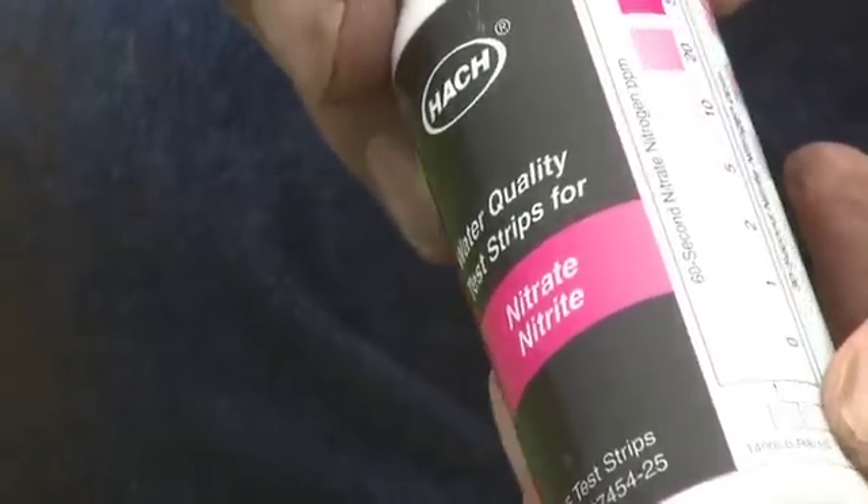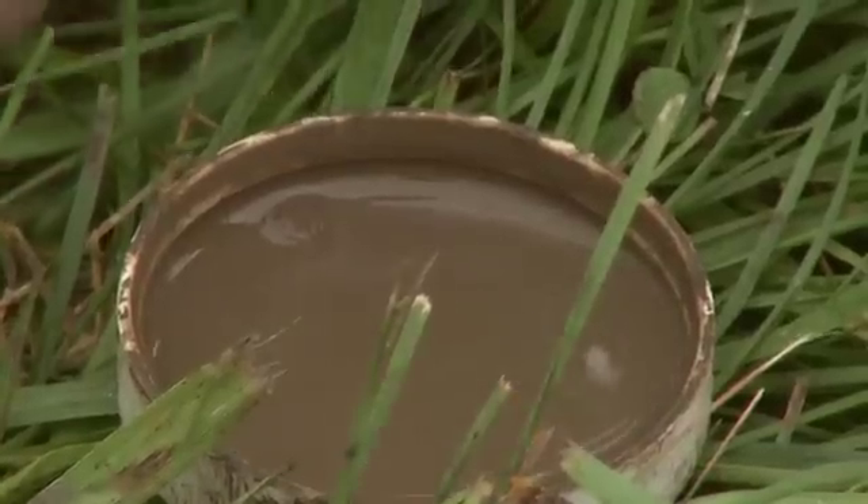We have the nitrate test strip bottle. It's got both nitrate and nitrite, and we're going to take a strip out. It's important that you keep this closed because it can get contaminated with moist air, so keep it in a cool, dry area. Now we're going to test for nitrate.